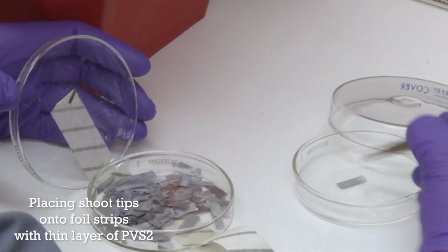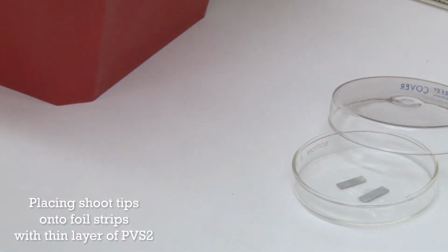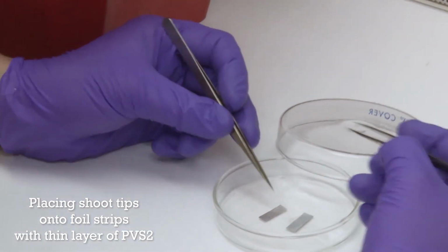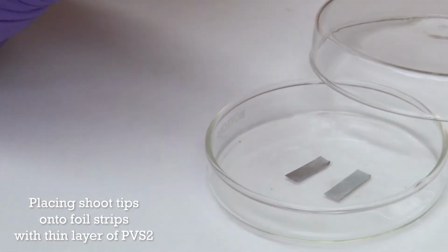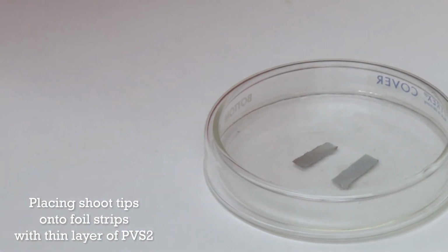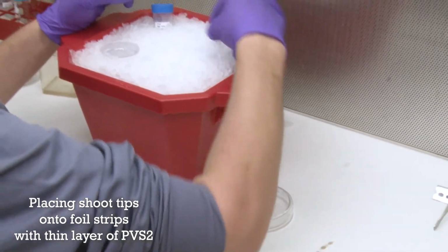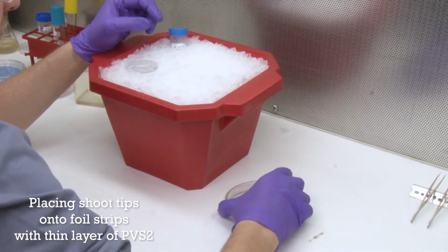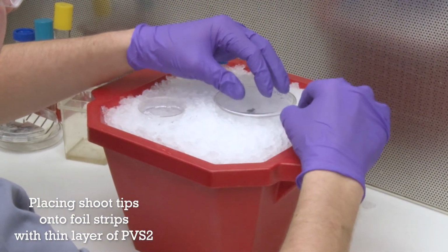Now we're going to prepare the foil strips that the shoot tips will be placed on into a thin layer of PVS2. If you want to make a small crimp in the foil strip, sometimes that is helpful in removing the foil strip with the shoot tips when you're finally ready to place them into the liquid nitrogen. We're going to put the prepared foil strips into the ice as well so that everything is nice and cold.